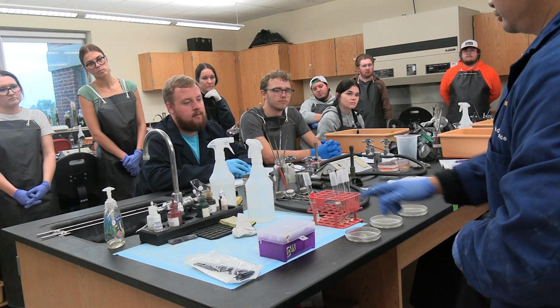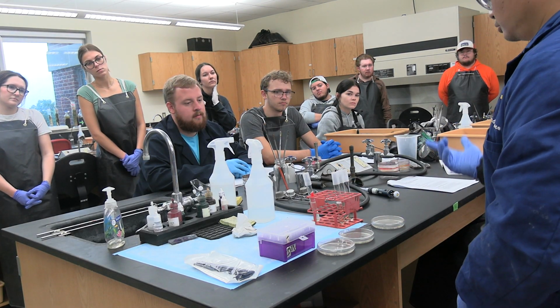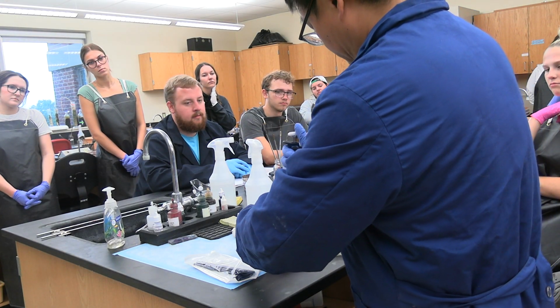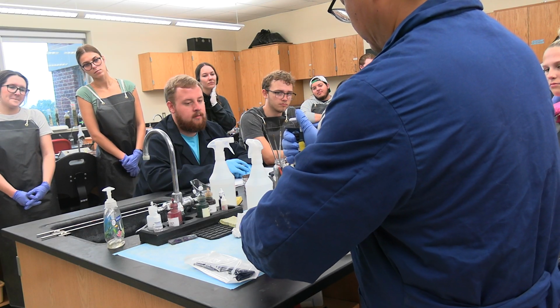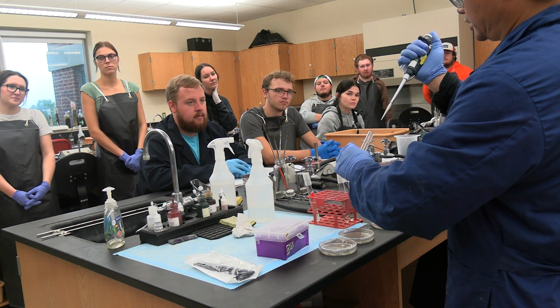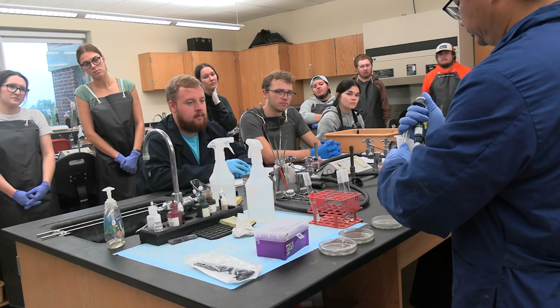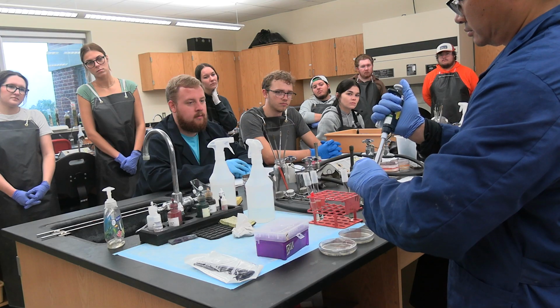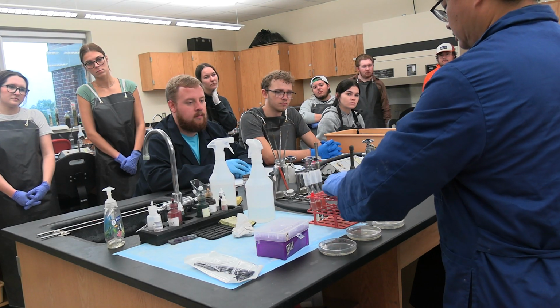So how do we do it? From here, going here. So place it right here. We're going to add it first of all. Only one tip, because we are going from high to lower dilution. It's only one tip. We shake it. So here. If you finished, put it at the back. Second. Last one.